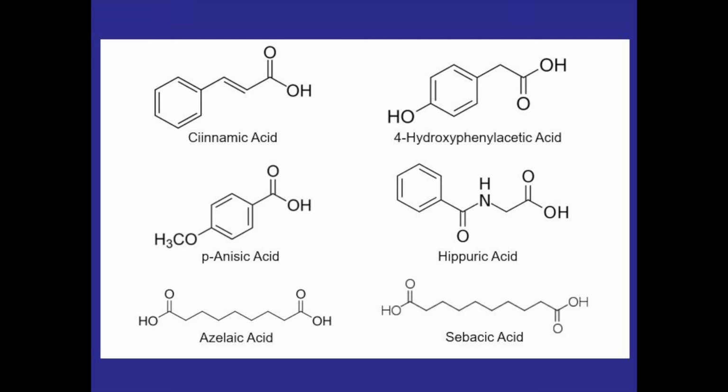So from here, we had to create a flow chart that would work in separating any unknown alcohol from any unknown acid. You can use the Cannizzaro lab procedure as a reference, since in that lab we separated an alcohol product from an acid one. But in this flow chart, we'll be making some adjustments and some changes since we want to create a general flow chart that would work for separating any mixture.